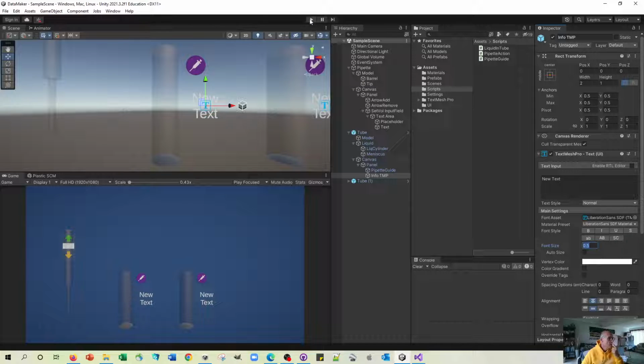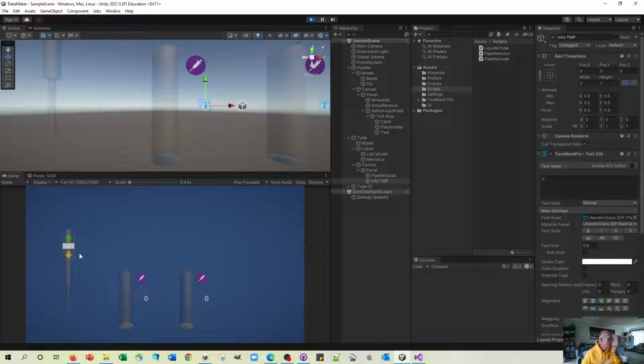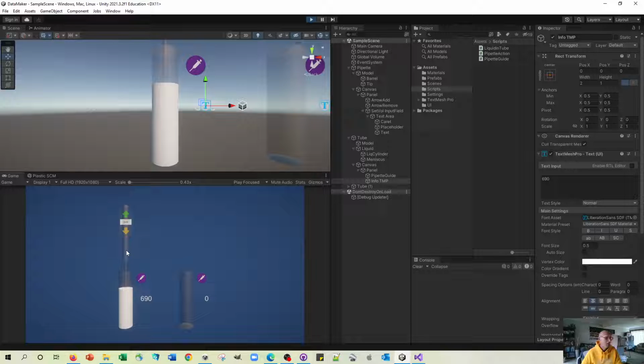As we saw in the summary video, we can type numbers in here like 345, and then when we direct the pipette to the tube, we can dispense 345 and another 345, and we can take away, say, 126, and it will do that. It will calculate what's left. So that's good. That all works very nicely, and you'll notice the pipette tip always goes to the meniscus.